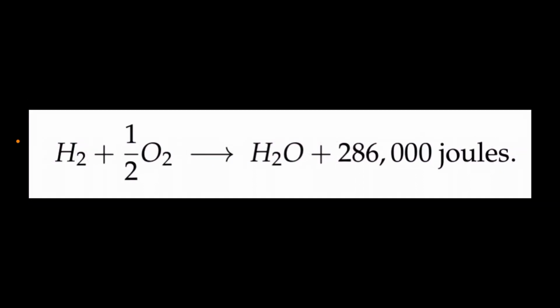And the second part of this experiment is a synthesis reaction where we combine hydrogen gas, H2, with oxygen, O2, which creates H2O, water, and a lot of heat energy. 286,000 joules of heat energy in this awesome experiment.